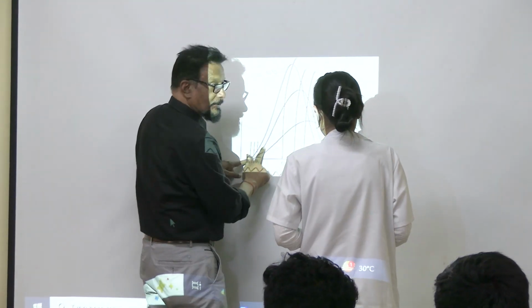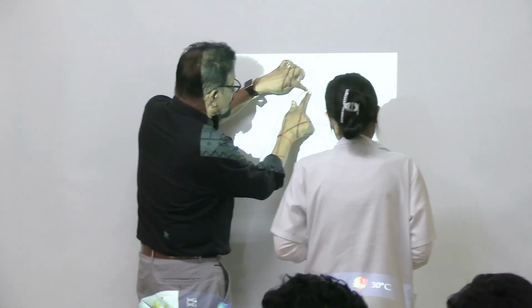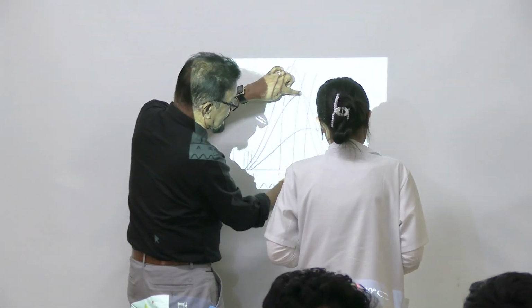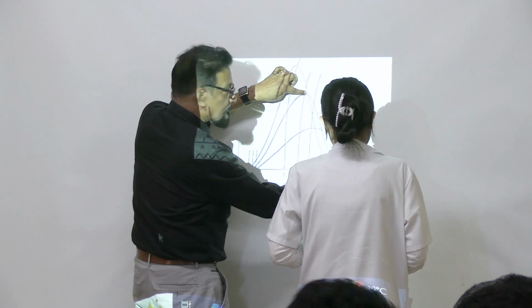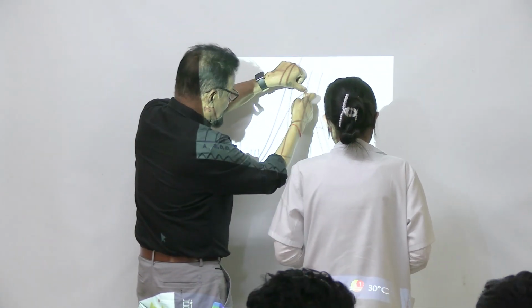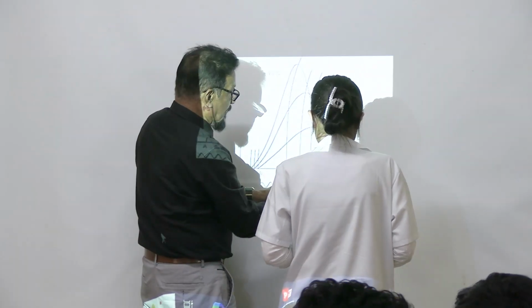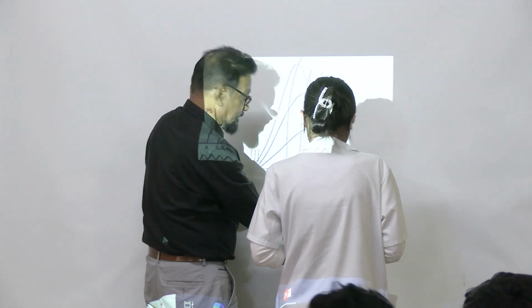So this is the contraction period with normal Ringer solution. Calculate it. This is the normal curve, with normal temperature. From here it started relaxing. Here is the end of relaxation. So maximum contraction is here. From this point to this point is the relaxation time.